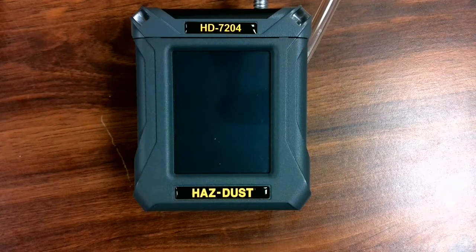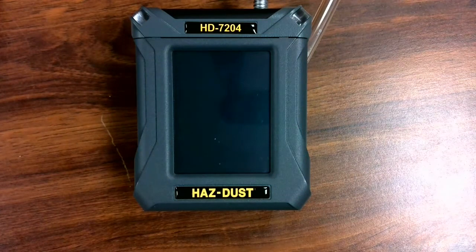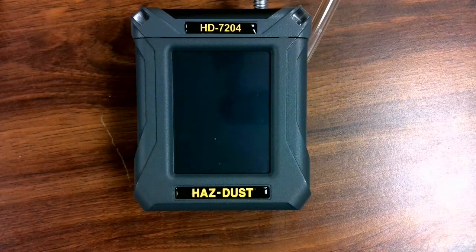This video will cover the basic operation of the HAZ-DUST Model HD7204.